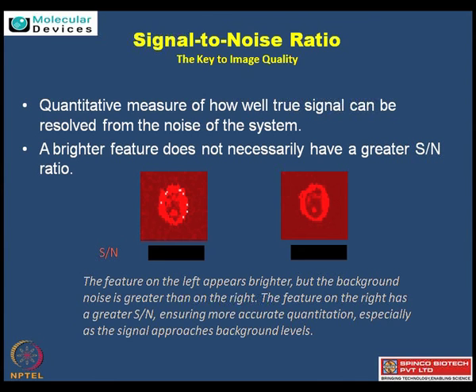So one needs to definitely adjust the signal to noise ratio to achieve very good image quality, and obviously simultaneously perform the PMT adjustment as well as other parameters. True. So as you go for the signal corrections, basically you're trying to follow the same thumb rules of not looking at saturations, Right, and then you expect the image to have the least background, so the valid information which is coming in the form of intensities becomes a true signal.